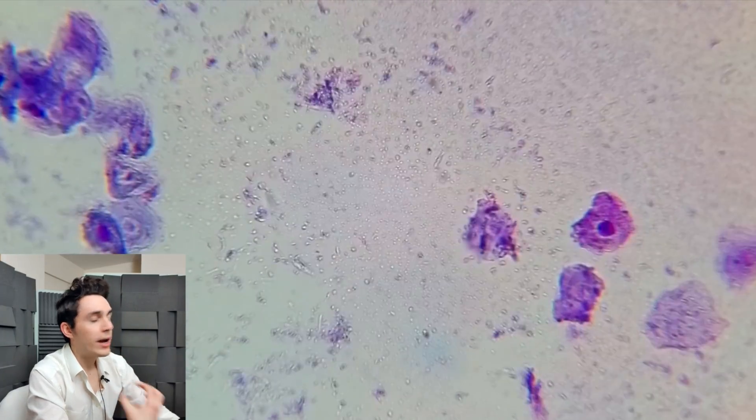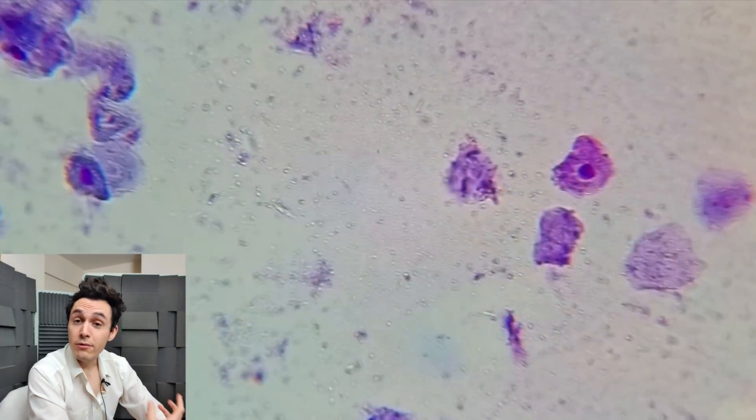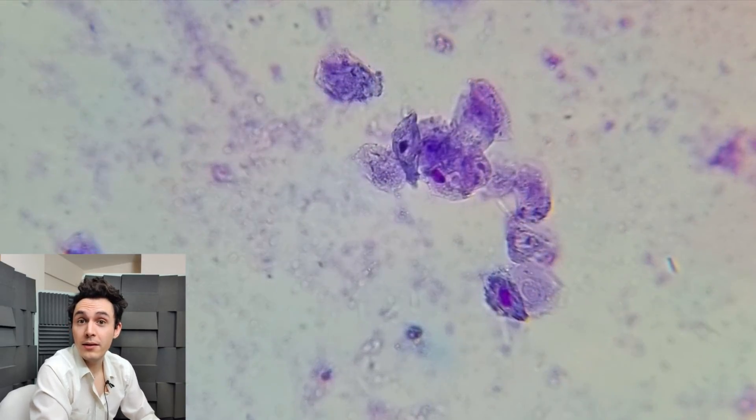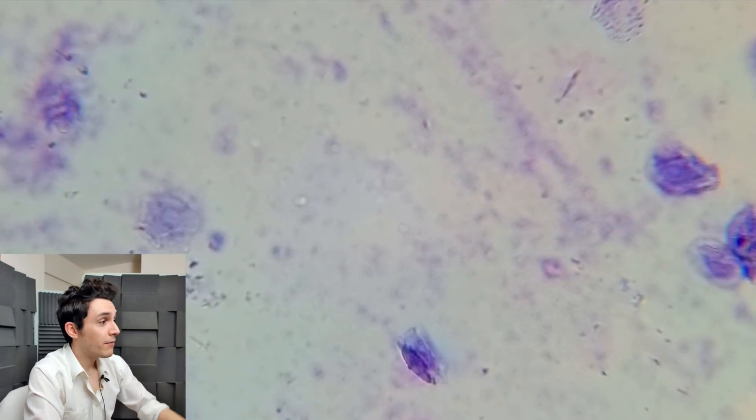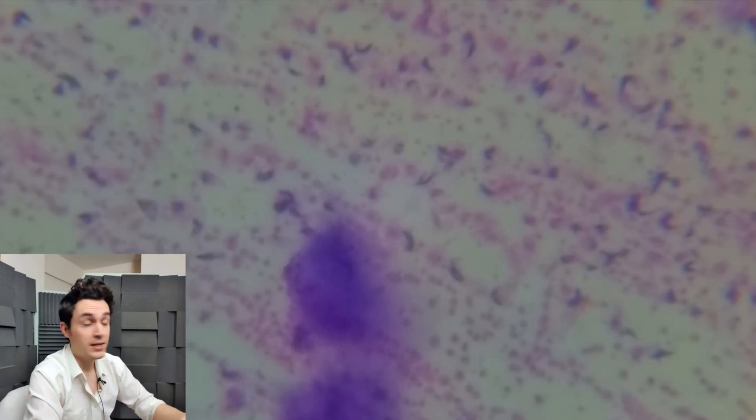What I'm looking for is a white blood cell. You can see more intact skin cells here, and a white blood cell — or leukocyte — will look very different because the nucleus will appear irregular. For example, a neutrophil will have a multi-lobed nucleus, and a monocyte will appear quite large with an irregularly shaped nucleus. Those little specks flowing across the slide are just water evaporating, carrying away debris and bacteria. I did look at the tissue before applying methanol and there was a lot of movement — lots of bacteria moving around — but now they're all dead because of the methanol.